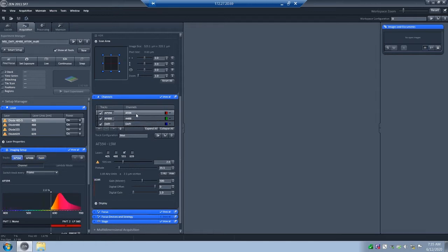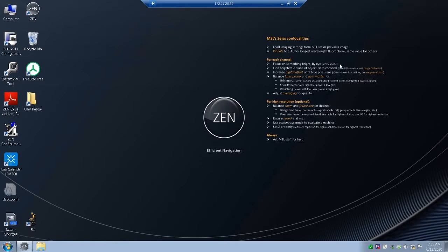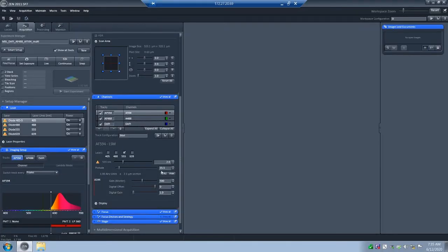Next, you need to focus on something bright and find the brightest Z-plane. I've already focused on something bright, particularly in the red channel. I'll work one channel at a time, so I'll uncheck the 488 and the DAPI. To get an image, I'll click 'Live.'